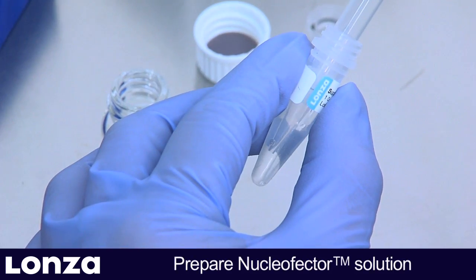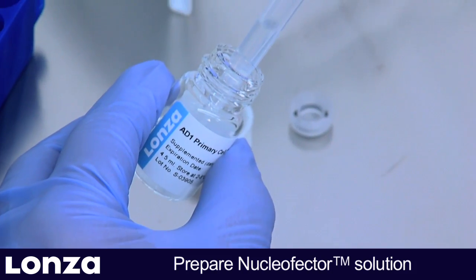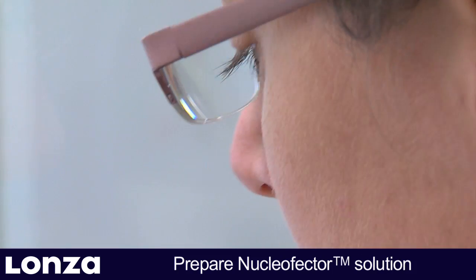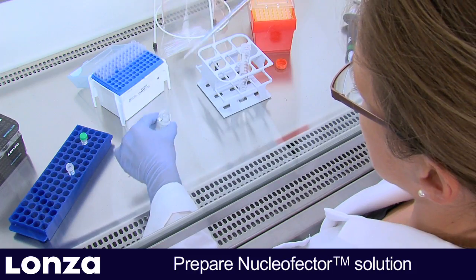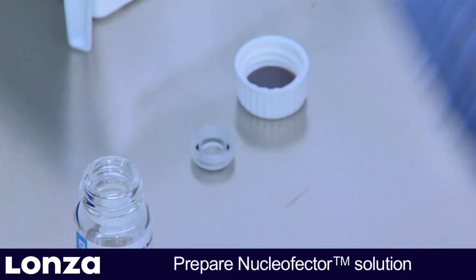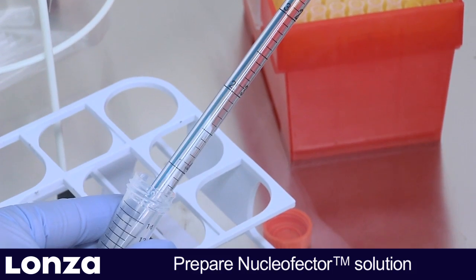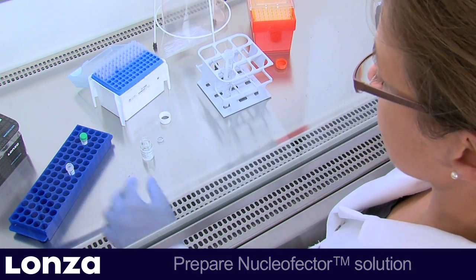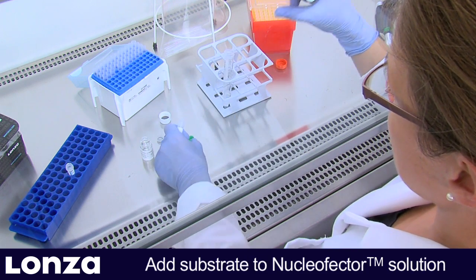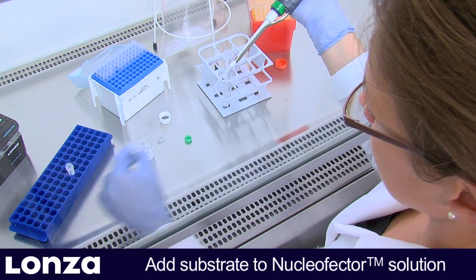Now add the entire supplement to the Nucleaffector solution and mix well. Once the Nucleaffector supplement is added to the Nucleaffector solution, it is stable for 3 months at 4°C. Transfer the supplemented solution to a fresh tube, then mix the required amount of pmaxGFP vector or substrate of choice with 350 µL Nucleaffector solution per sample.